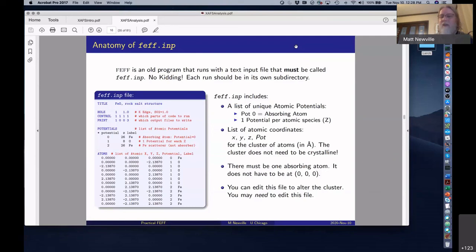You can add a foil either downstream of the sample, or scatter into a foil upstream of the sample if you can't get transmission through your sample, or measure the foil once a day. All of those work okay, and for a lot of beamlines that's now working well enough for these instrumental corrections. But I'm not certain that all of them are that way, and it's hard for the user to deal with that fact when there are instrumental variations.